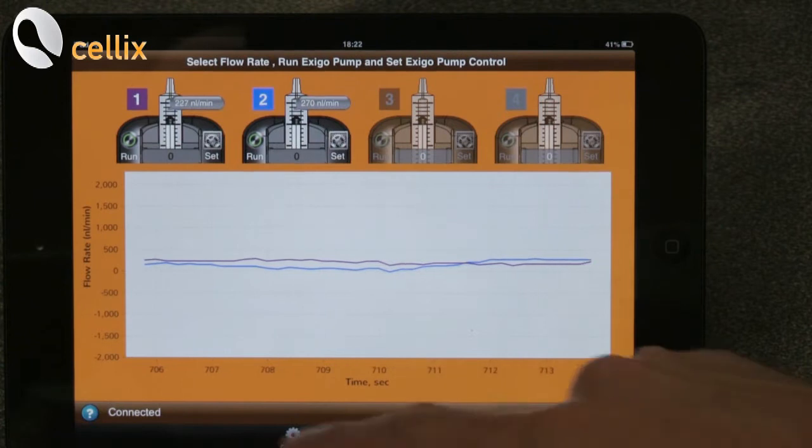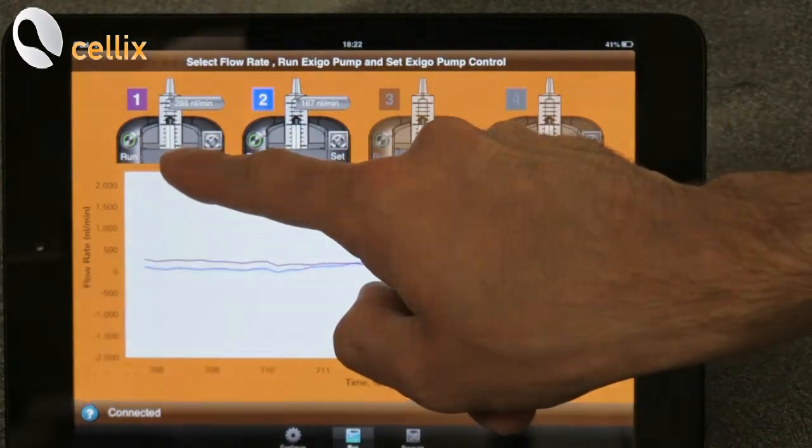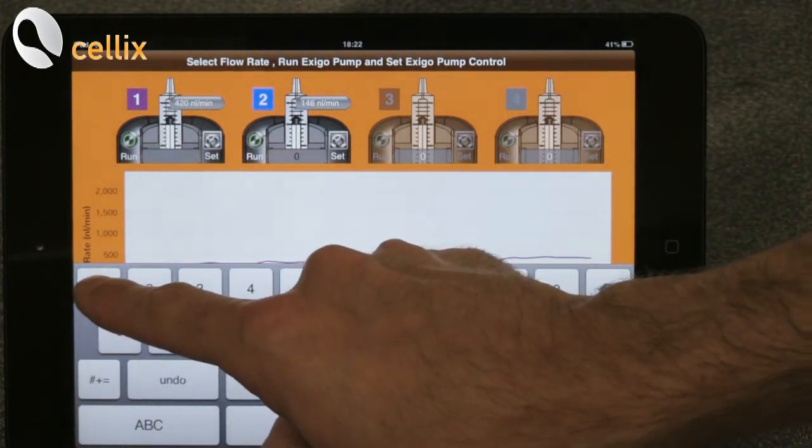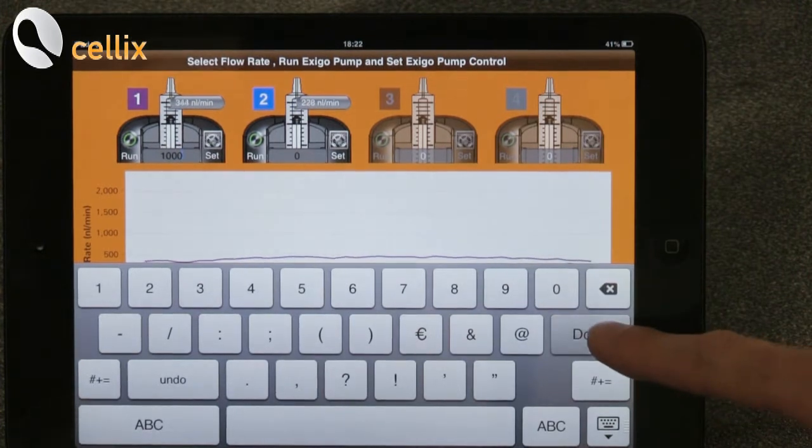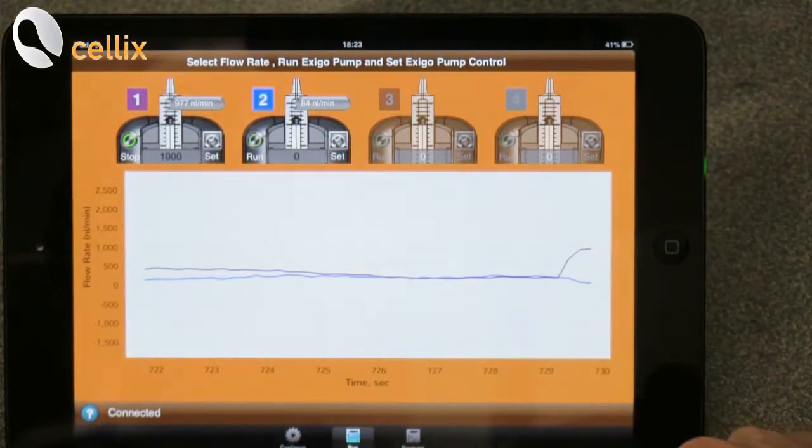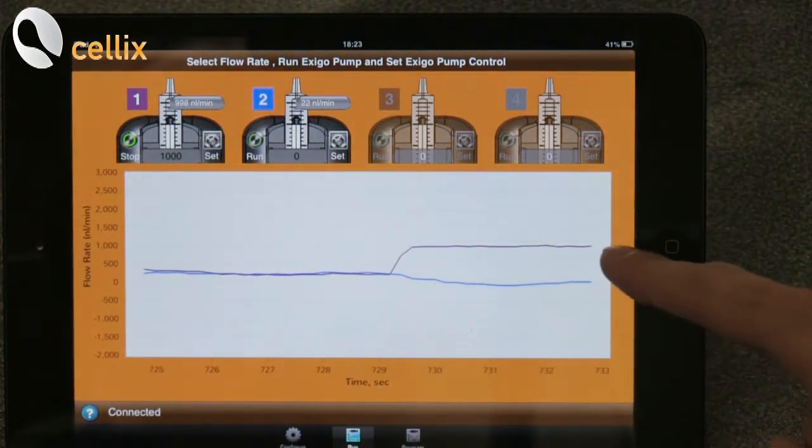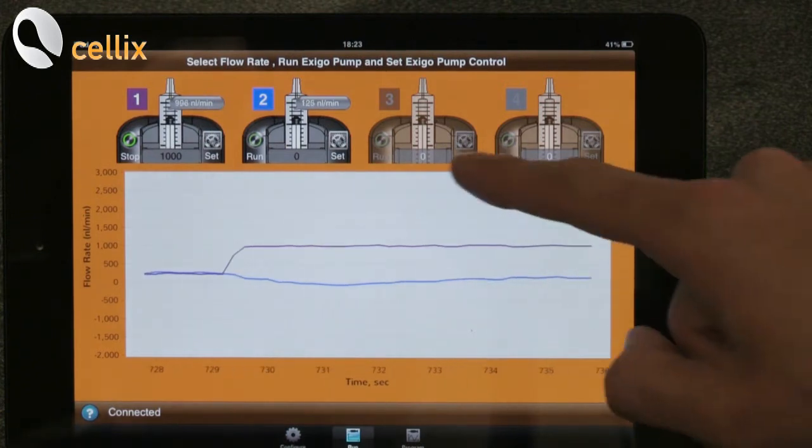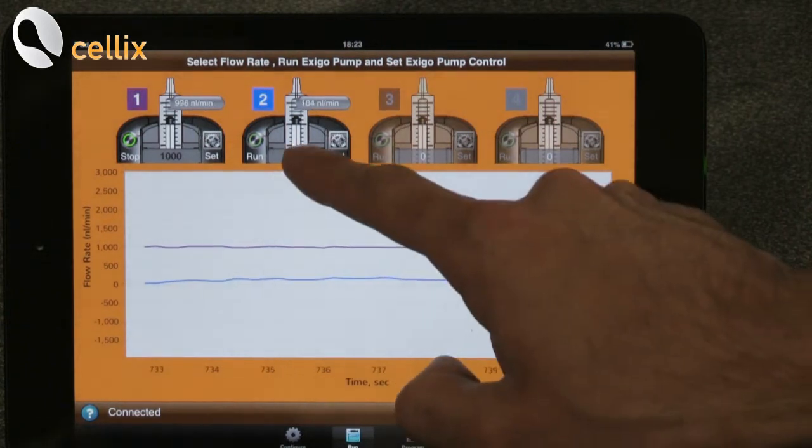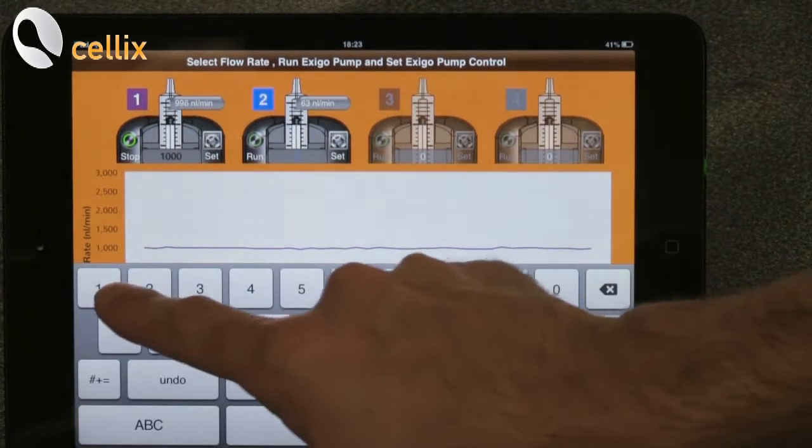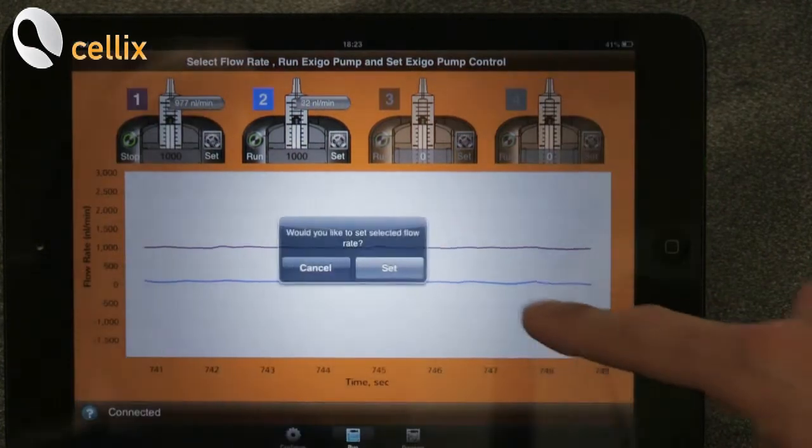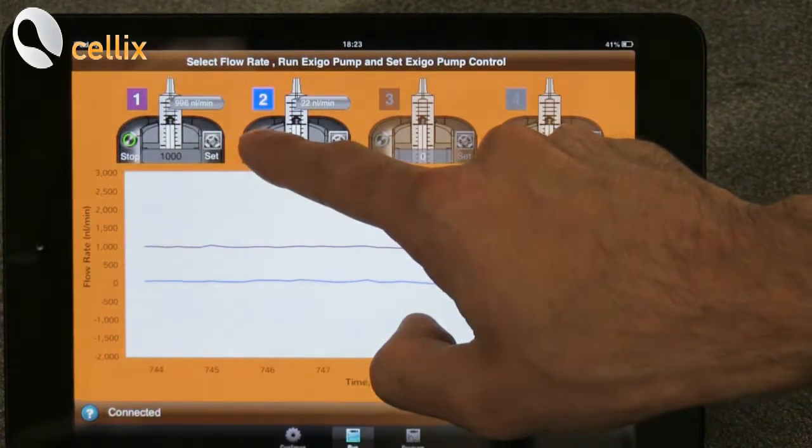We can now set the flow rates. So we can click here in the space for the flow rate. The flow rate is set in nanoliter per minute. So we select 1000. We click done. Set and then run. As we can see this is the actual value for the flow rate. We can do the same operation for the pump number 2. We click. We enter 1000. We click done. Set and run.